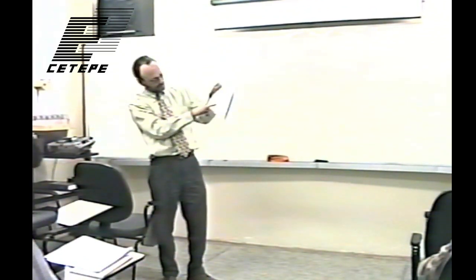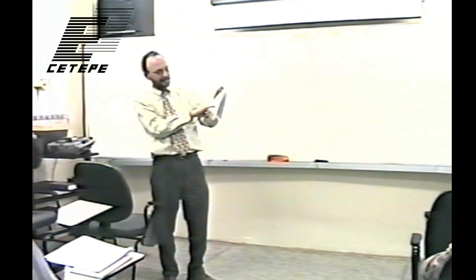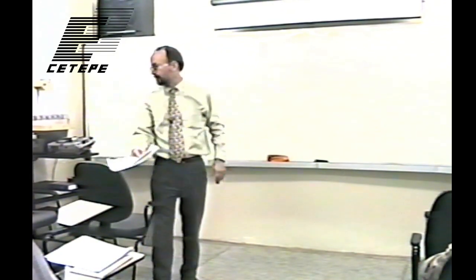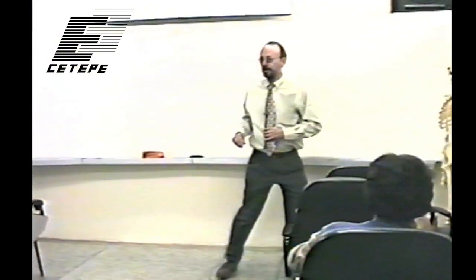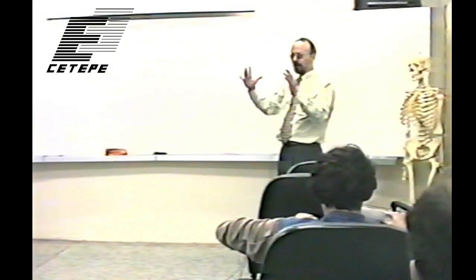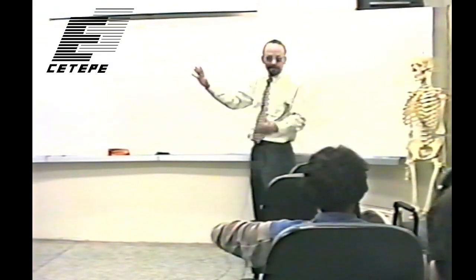And then you have a slight loss in the output phosphor. And then you have a large loss. Here it says entering pupil. But you can think of that, this lens system that I've shown here could be thought of as the pupil. So you do have quite a big loss in terms of what you can capture with the lens. So what I've tried to show here is, in the old days, and even still today, there are just analog optical ways of looking at this light image here. You could project it onto a screen, for instance.